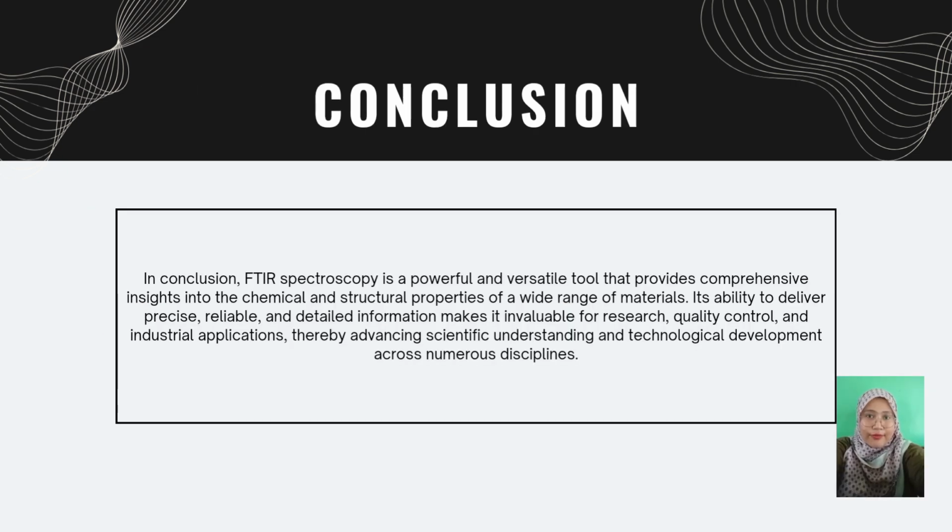In conclusion, FTIR spectroscopy is a powerful and versatile tool that provides comprehensive insight into the chemical and structural properties of a wide range of materials. Its ability to deliver precise, reliable, and detailed information makes it invaluable for research, quality control, and industrial applications, thereby advancing scientific understanding and technological development across numerous disciplines.